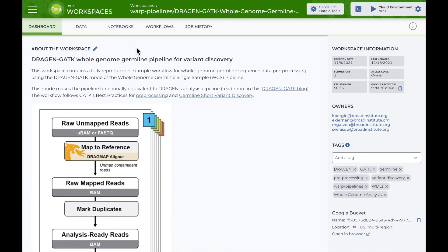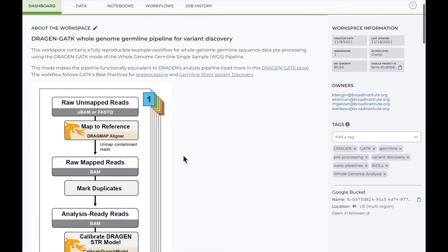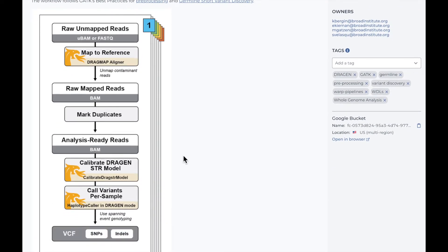Let's take a tour and then I'll show you how to clone the workspace so that you have an editable copy of it where you can try the analyses. This workspace contains the Whole Genome Single Sample, or WGS, analysis pipeline, which takes in unmapped BAM files and performs preprocessing like alignment and QC calculation and initial variant calling. We are featuring two pre-configured workflows that run the Dragon mode of the WGS pipeline. Dragon mode aligns reads using the DragMap aligner and calls variants using the GATK tool HaplotypeCaller in Dragon mode.